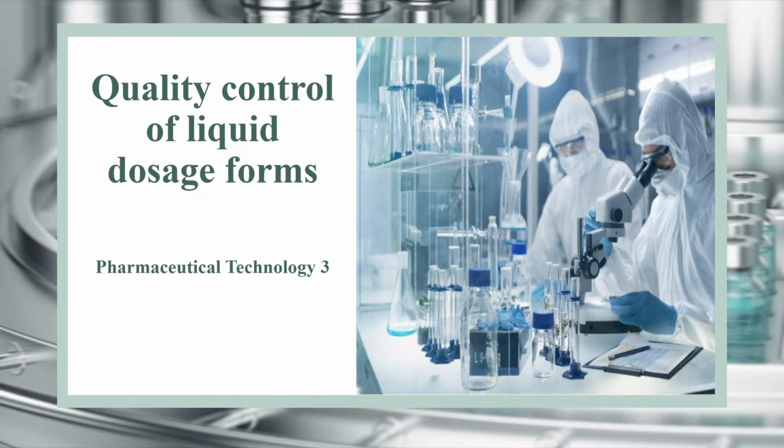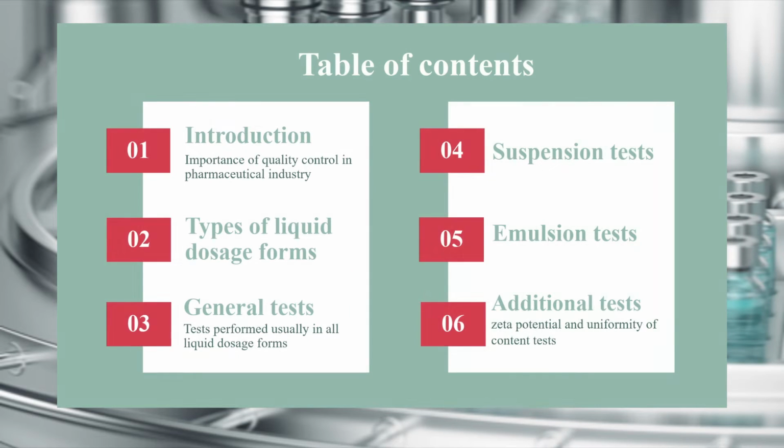Hello everyone. In this video we're talking about quality control of liquid dosage forms. As you see in the table, these are the points we're discussing in this video. First of all, we're talking about introduction. After that, we're talking about types of liquid dosage forms, then general tests, some specific tests, and finally some additional tests.